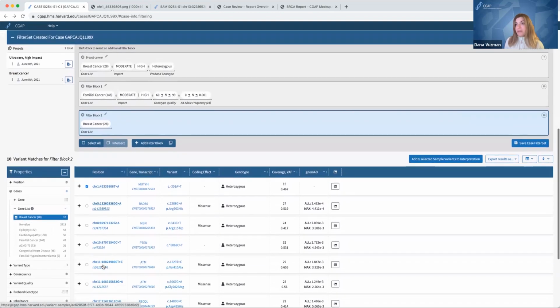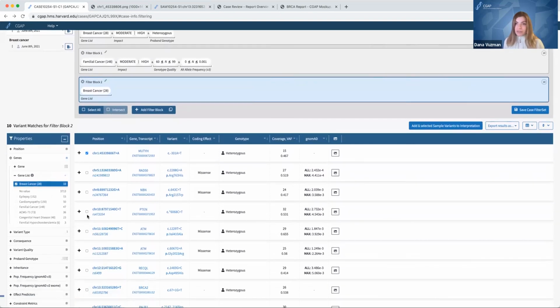And now we would like to do the same technical review for all of the 10 variants available here.